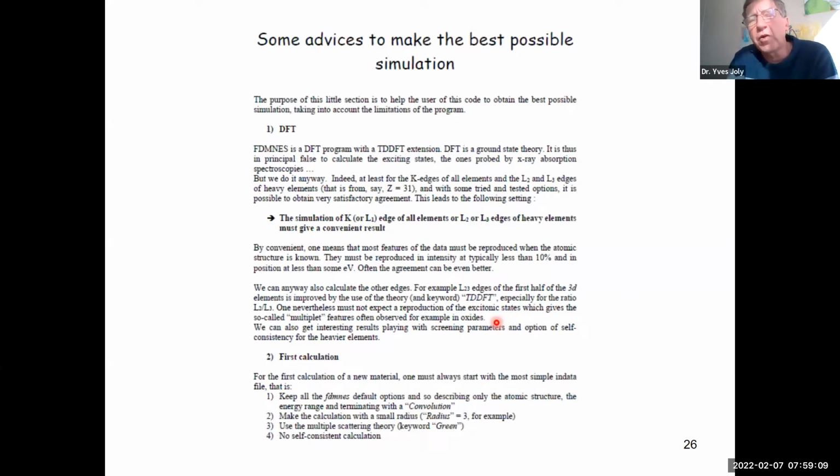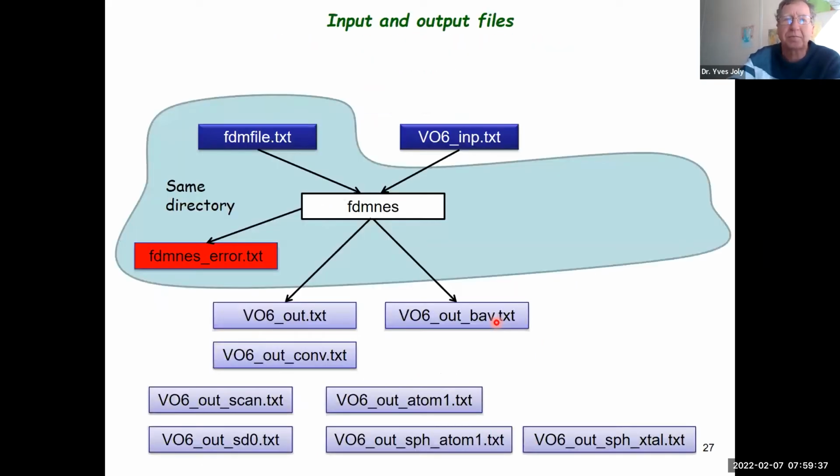And also, rather close to the end, very importantly, I've written two or three pages, so it's rather short, with some advice to make the best possible simulation. So please, if you have never done it, read these two or three pages before making calculations. Some of the points I will explain during the tutorial, but it's good to see how to make the best possible simulation.